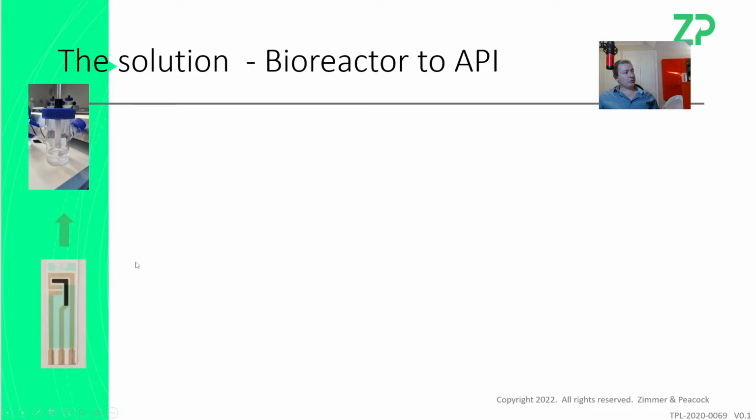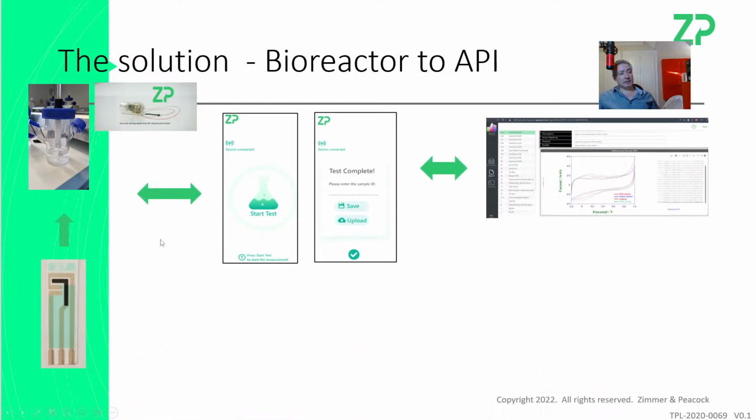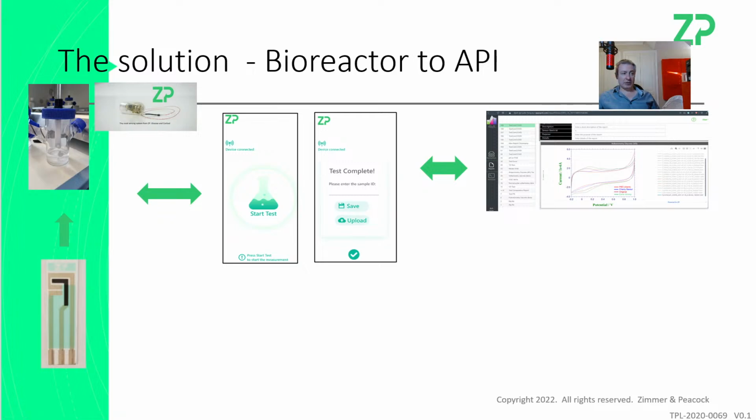So if we were saying a glucose sensor, it has to go, essentially for me, through the lid at the moment. I understand this. With bioreactors, you have unusual things like sterility and in-place sterilization. It's not an easy application. So we do have the sensors. We probably have the electronics as well. And we definitely have the connectivity to the cloud capability, and we could send the raw data to the cloud.